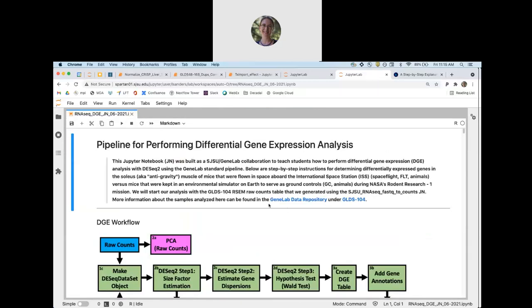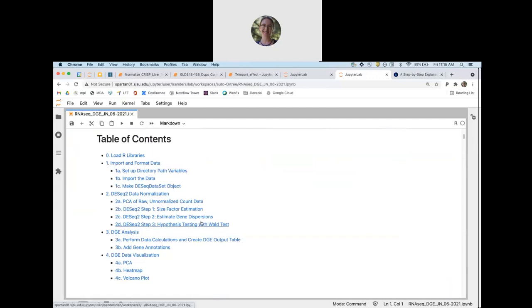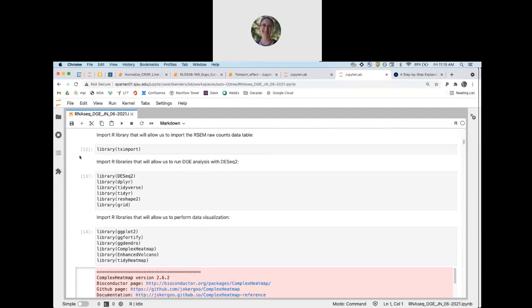Now, since we have closed the kernel, we can't pick up where we left off until we rerun everything that we ran yesterday, because we defined a bunch of variables and imported a bunch of libraries that we're going to need to use today.